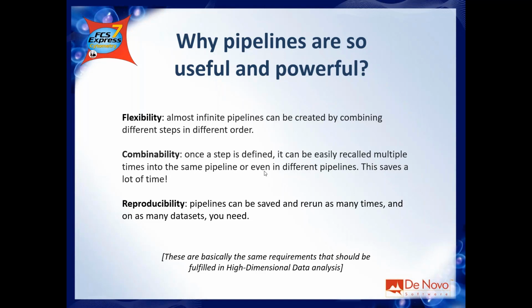Since algorithms are provided as standalone pieces of calculation, you need to run one, then, for example, save and export the data to create a new FCS file or a new CSV file. Then you need to re-import it if you want to run calculations on the data generated by the first algorithm.